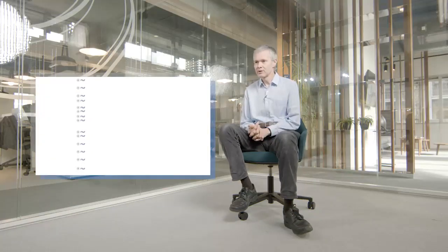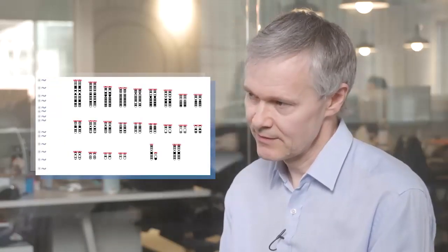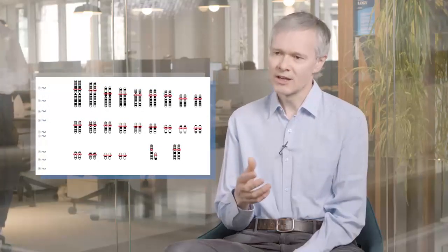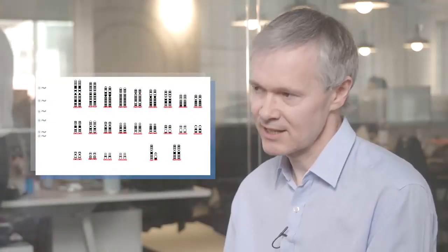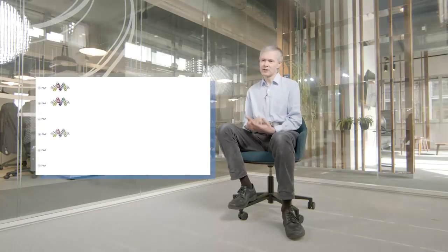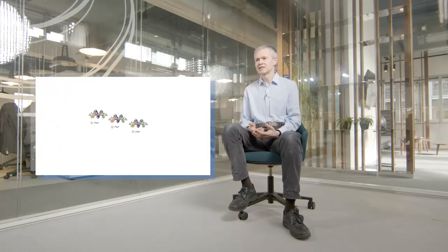In a second step, we look at the specificity of the designed TALENs. For that, we use a second model that will scan the genomic sequence, look at the homologous sequences, and evaluate the probability that these sites are cut. Once we have determined the best candidates, we send them to the New York lab so that they can synthesize them.